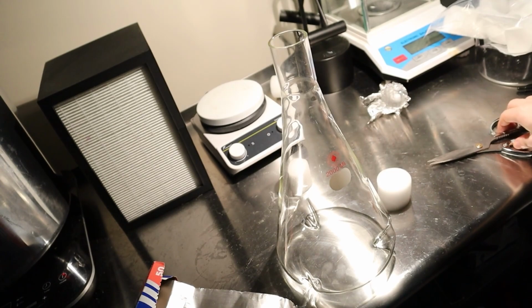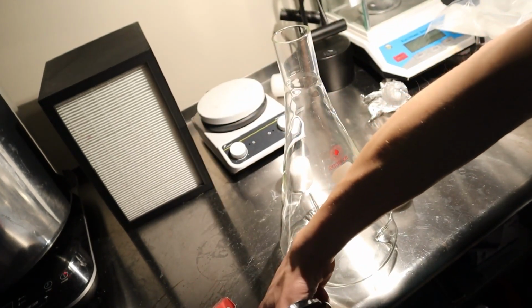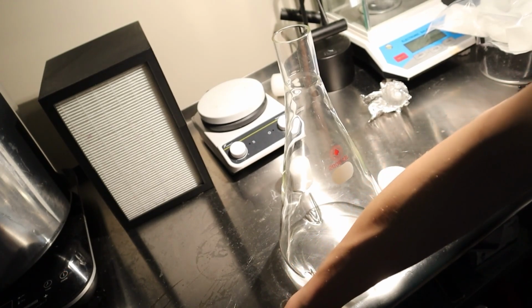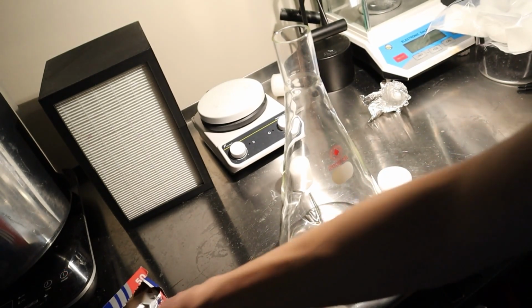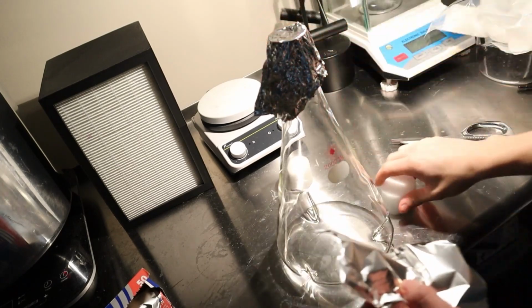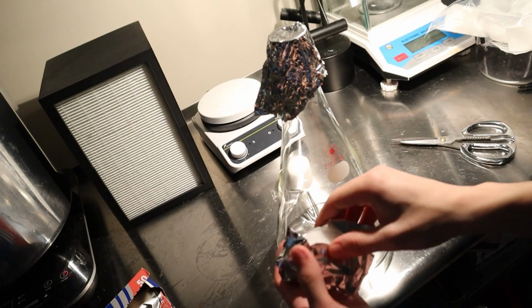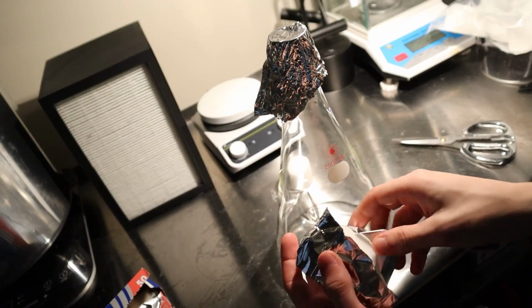So, how do I do this? I could cut off a piece of foil, and then I could autoclave this like this, and then this separately. Okay, that's excessive.